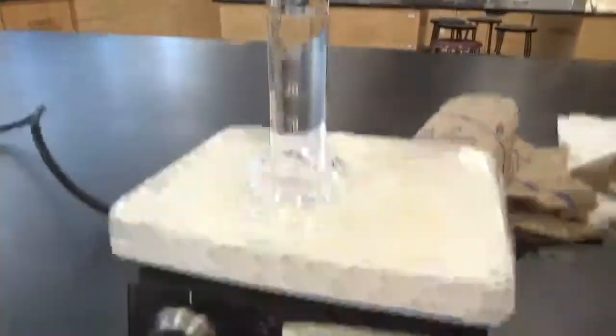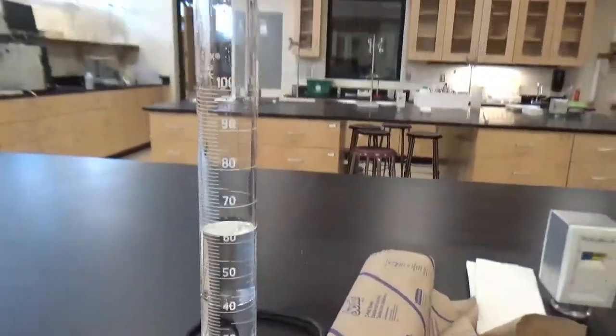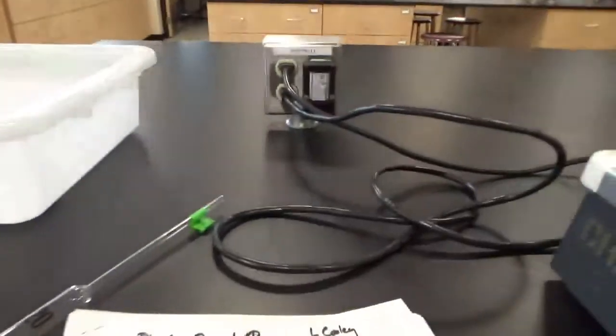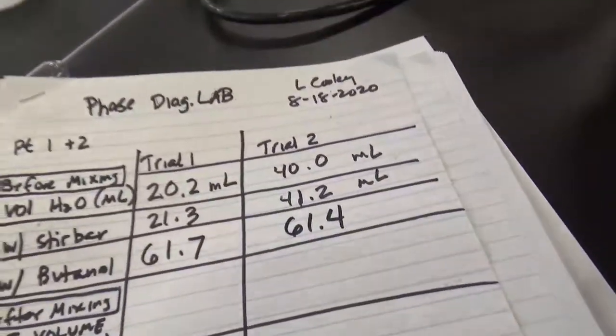Let's go over here. I'm going to do the same for this one. This looks like 61.4 milliliters. When you look straight on it, it's 61.4.